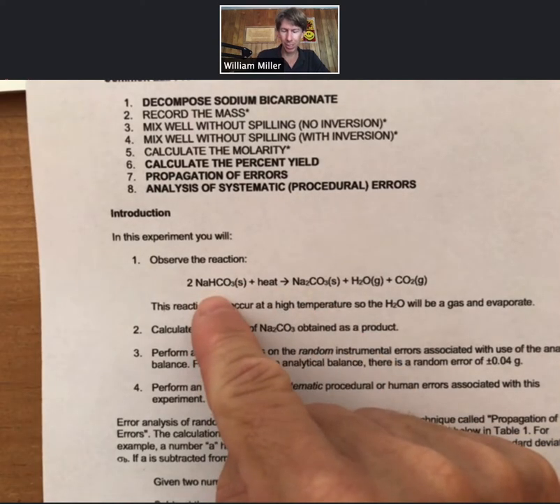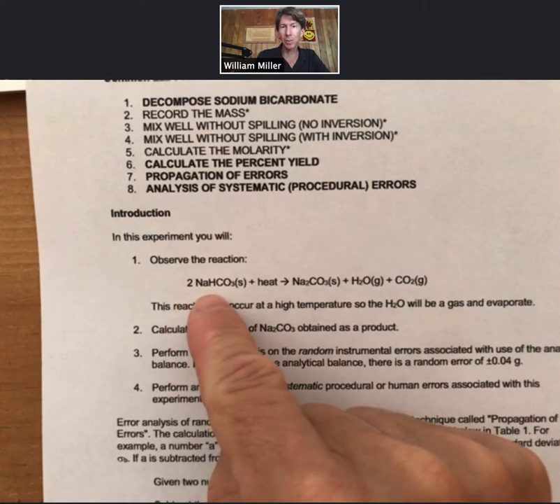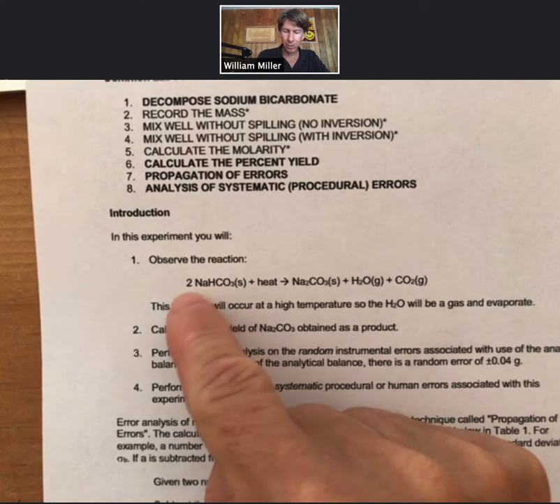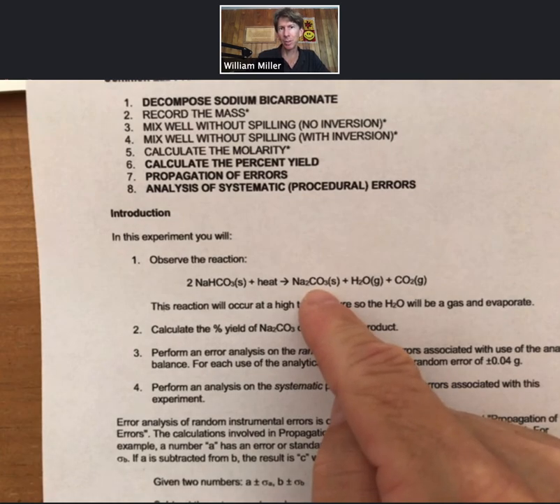What we're going to do is stoichiometry to show that based on our amount of sodium bicarbonate that we start with, we can calculate the theoretical amount of sodium carbonate we should produce, and then also measure the actual amount of sodium carbonate we produce.